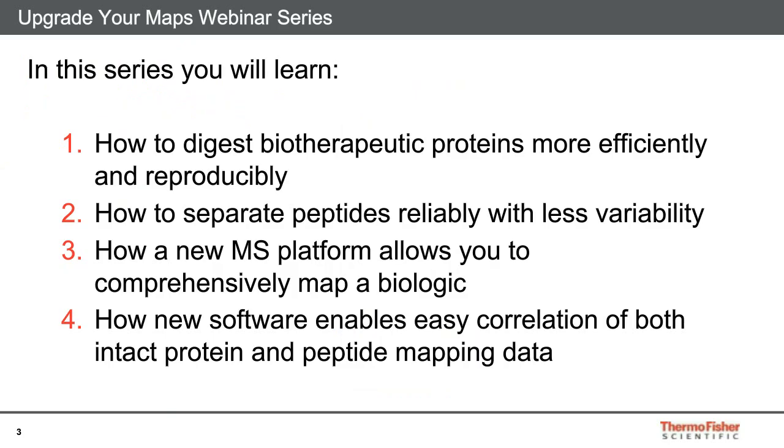Over the course of this series of 4 short webinars, you will learn about the advantages of our full peptide mapping workflow. We will present advances in protein digestion, peptide separation, detection, and data processing using new tools that represent a significant upgrade to existing methodologies. Our second episode in the series today focuses on the importance of reliable and efficient separation of peptides in biopharmaceutical peptide mapping. So I would like to welcome Dr. Mauro Depra to begin the presentation.